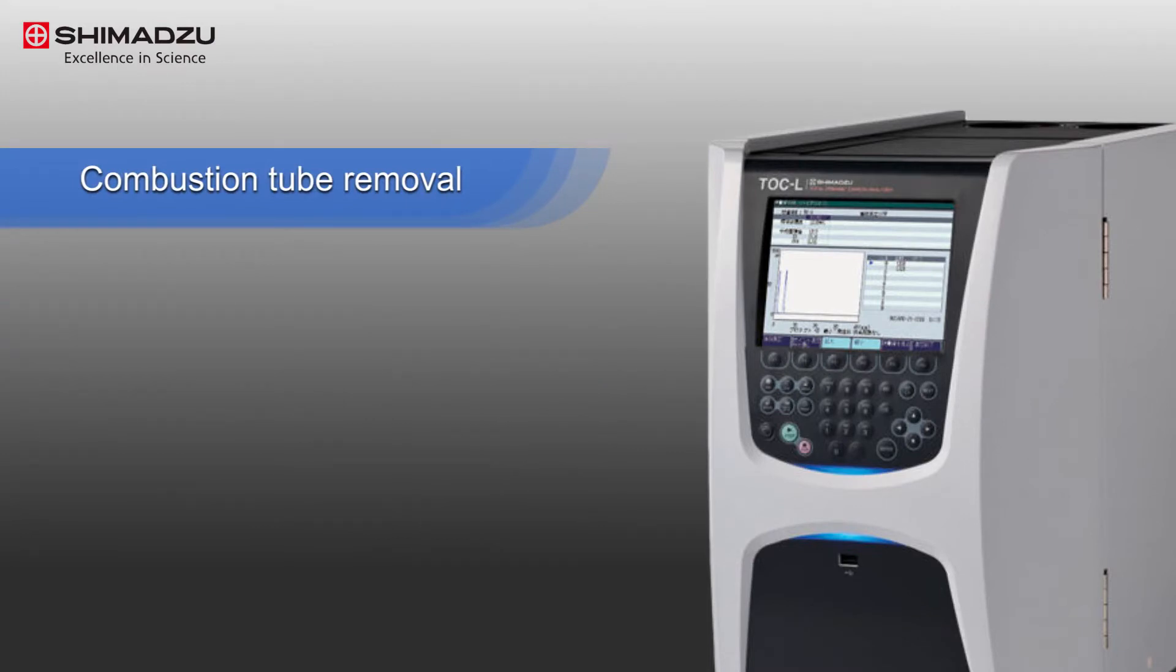We will start with the removal of the combustion tube. Be sure to operate the following steps when the temperature of the electric furnace is at room temperature.